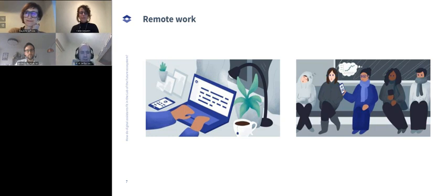And within the pandemic, everyone's now really got into having these Ring and Nest doorbells that tell you when Amazon are coming to drop your packages off. We remotely monitor our front doors, our houses, and the garden, and watch the birds. But we're way away from that at the moment with the laboratories. There's a huge amount of opportunity there to improve that and make it into more streamlined packages. At the moment, you might have something that sends you an email or an SMS or an alert. What we're lacking is something that brings it together.